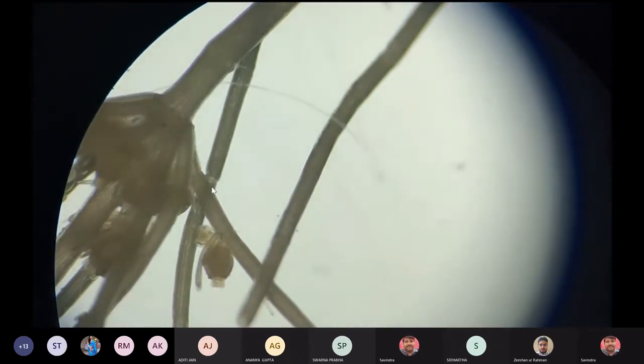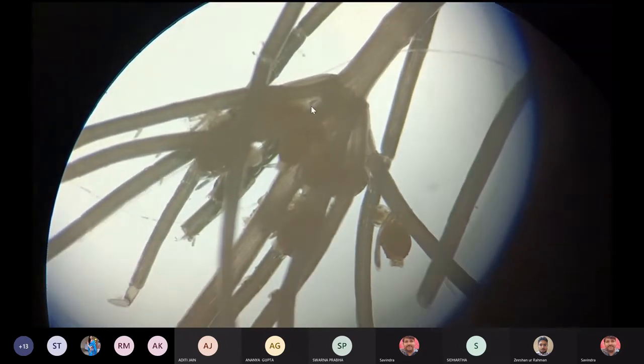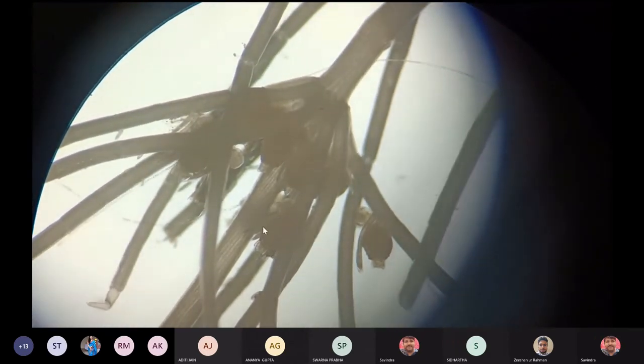आपको दिख रहा है ये? These are the sex organs. Yes, sir. Sex organ हम बाद में बात करेंगे. But you can see the nodes, internodes. Okay, the whorl of the branches or branch of limited growth, and आपको nodes नोड बिल्कुल क्लियर दिख रहे हैं यहाँ पे, एंड सेकेंडरी लेटरल्स पे आपको दिख रहे होंगे बीच बीच में। ये देखिए स्पाइन लाइक स्ट्रक्चर, यस और नो? Yes, sir. Let's try one more time.